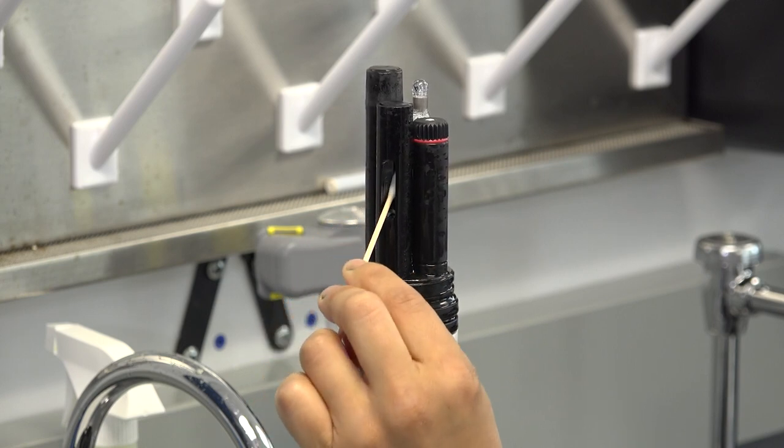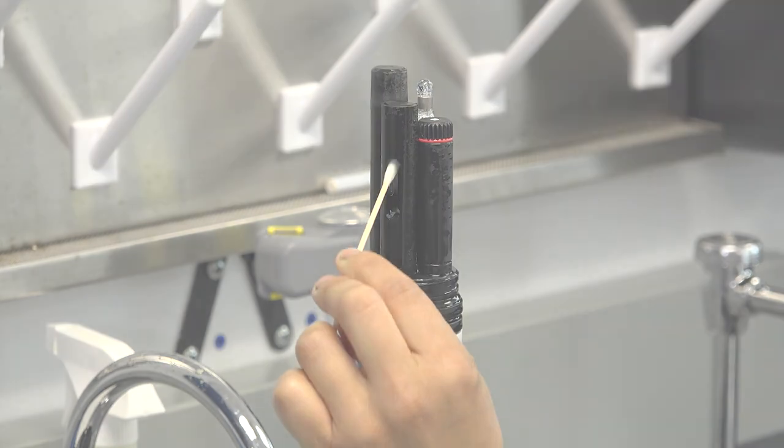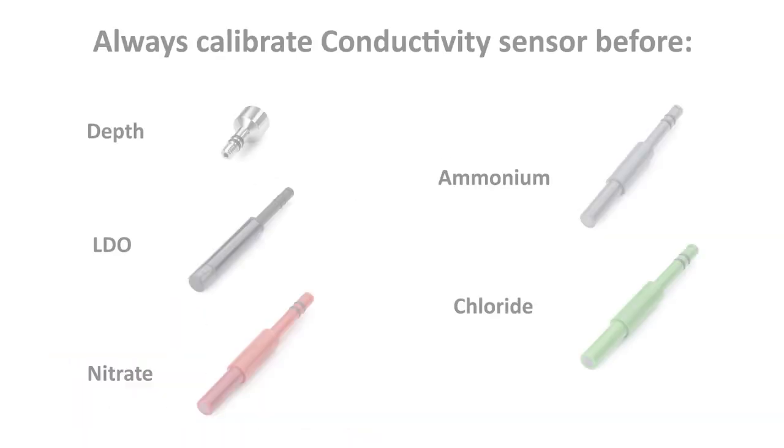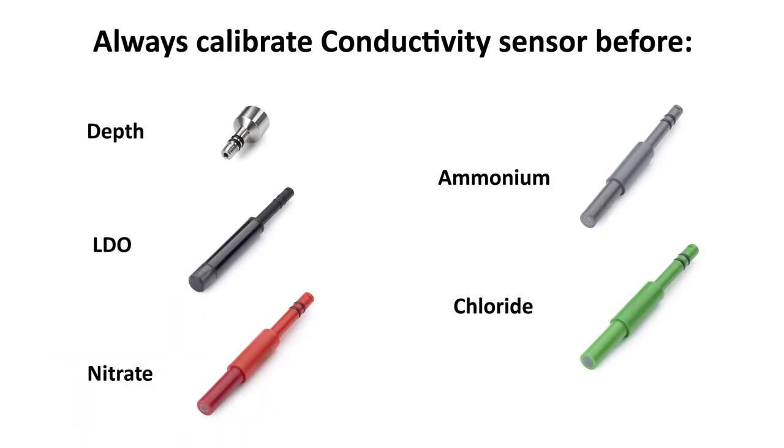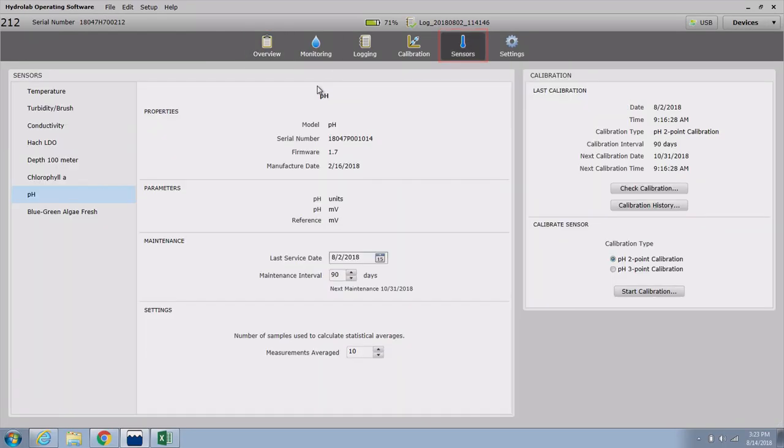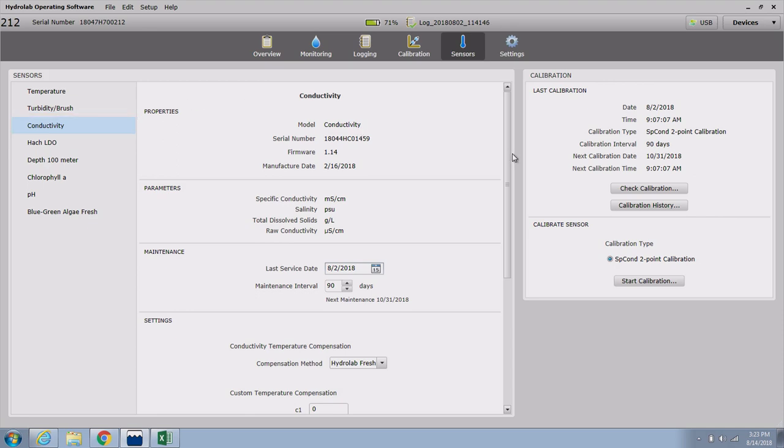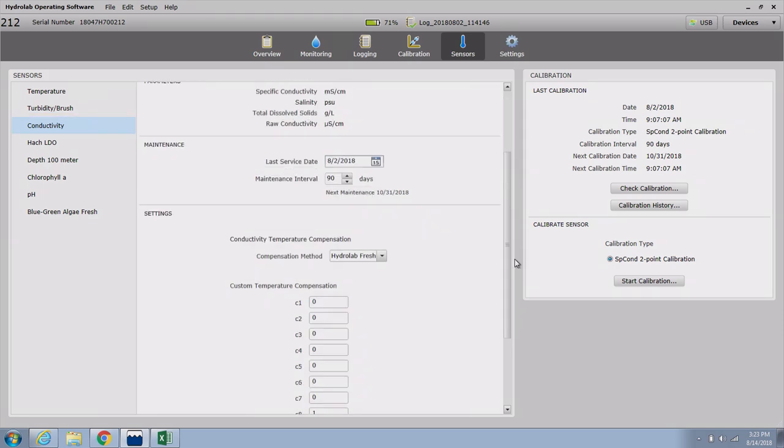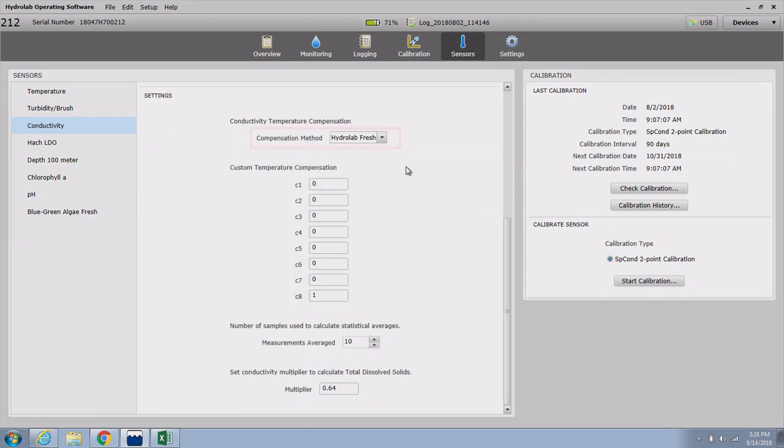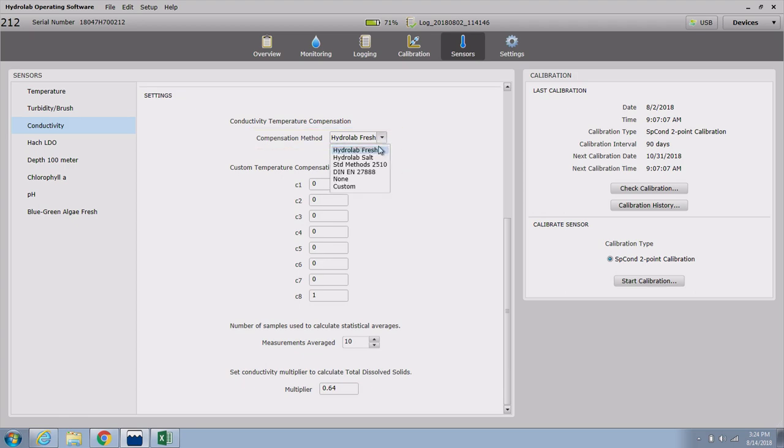Calibration: Important! The conductivity sensor requires a two-point calibration. Calibrate conductivity before LDO, depth, nitrate, ammonium, and chloride sensors, as these sensors are dependent on the conductivity readings. Ensure that the desired temperature compensation method has been selected for your application in the sensor tab of the HydroLab operating software. The default compensation method is HydroLab fresh.